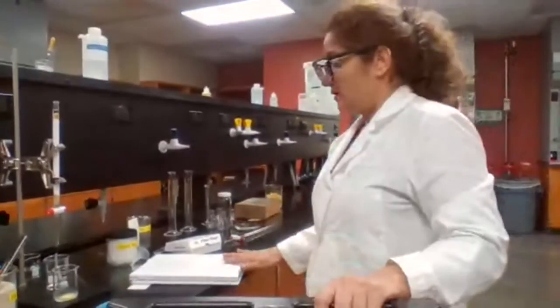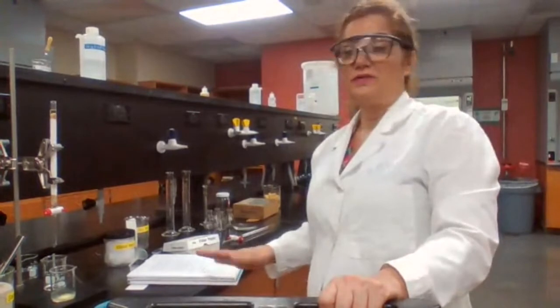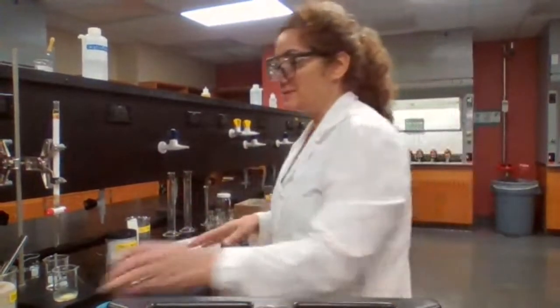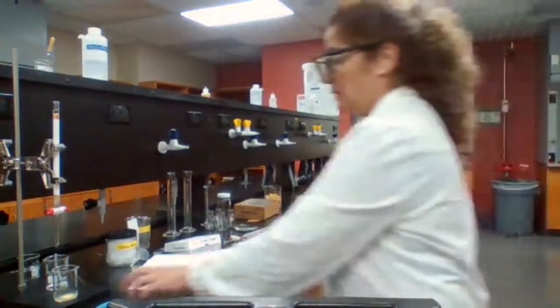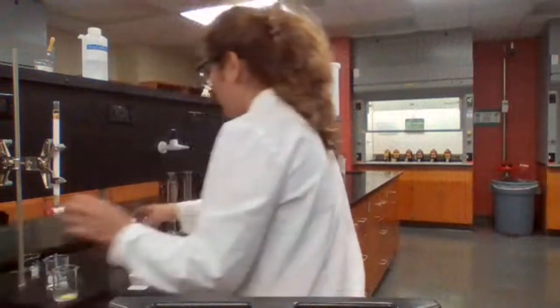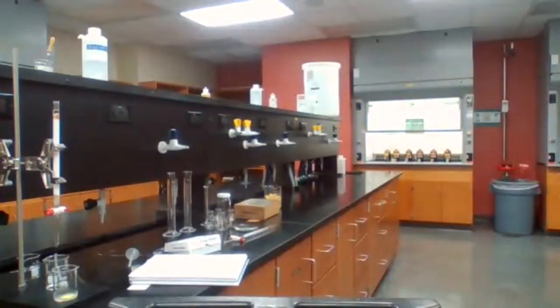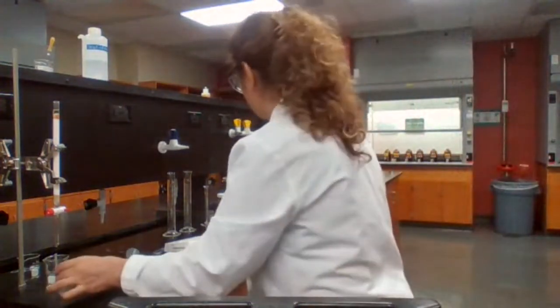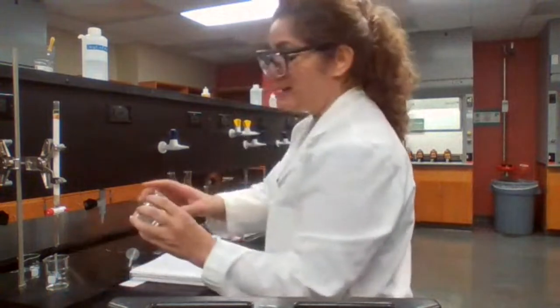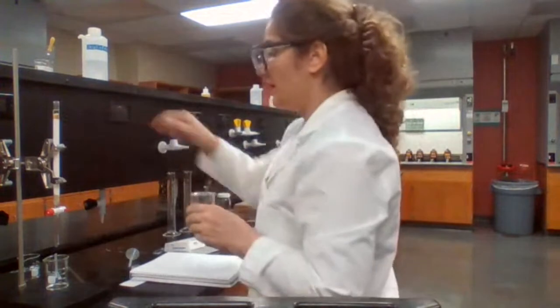Okay, we are going to move to the next part, which is the column chromatography. Do you have questions about the TLC? Okay, that means no questions. That's good. So I'm going to add the toluene to dissolve it and bring it back to start the experiment.